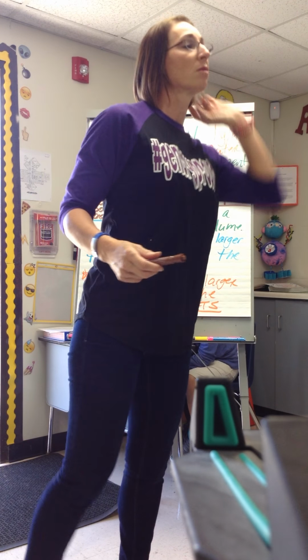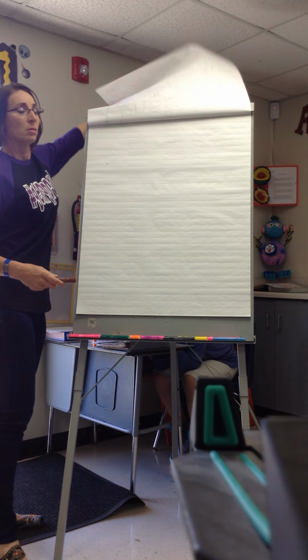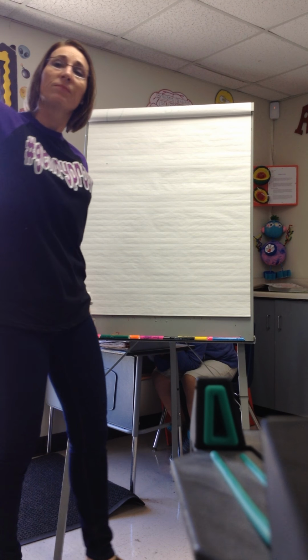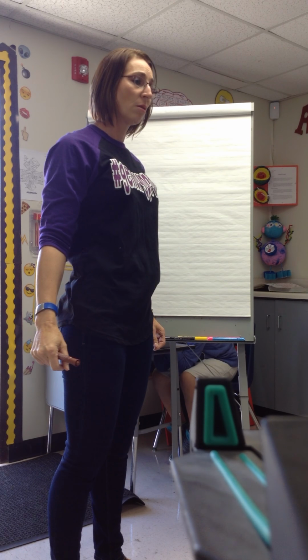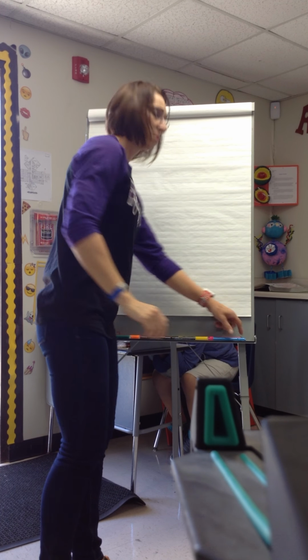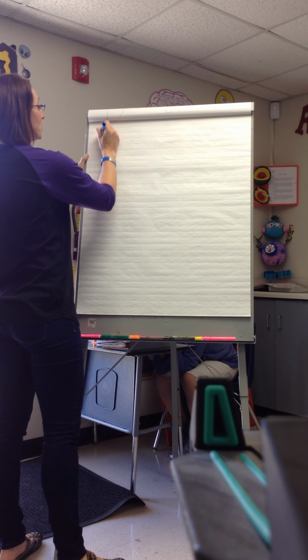All right. Yes. So is the stuff that doesn't have water in it volume or mass? Say that again. In this thing, is the empty stuff, the part that's not filled up with water, the mass or the volume? I don't understand what you're saying. When you divide it, to calculate density? Yes. Okay. First thing you're going to do when you go to your stations, you're going to have two graduated cylinders.